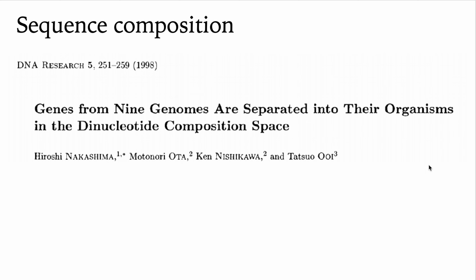So getting back to this k-mer sequence composition that I mentioned earlier, what does that mean? What is that all about? And this becomes important for several analyses down the line as well. So early on in research into microbial genomes, researchers found that you could separate those genomes into different dinucleotide composition space. So essentially, different genomes representing different taxa have corresponding composition of dinucleotides. So what does that mean?